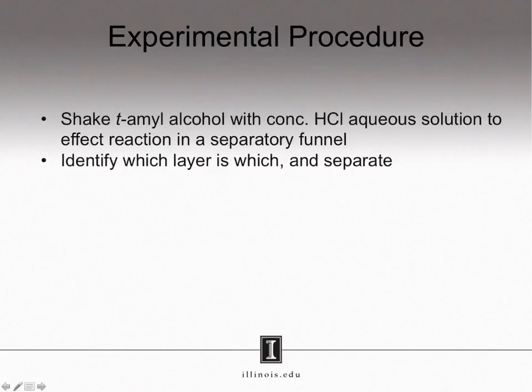You will then identify which layer is which. One layer will be your aqueous solution, and one layer will be your product. Think back to the extraction experiment. How can you identify which layer is your aqueous layer and which layer is your organic layer if you don't know which one is which? Speaking of the extraction experiment, you will then use the skills you learned in that experiment to purify your product.